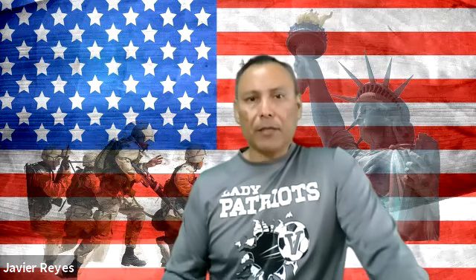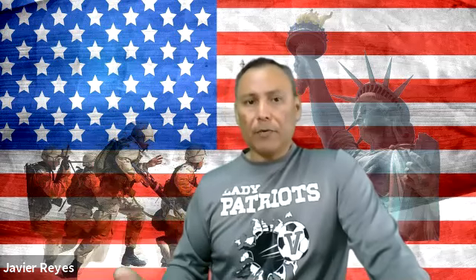Urine specimens are not tested promptly. Urine components can change. If you're going to collect a urine sample for urinalysis, okay, you cannot have it lying around the desk for too long. How long can a urine specimen be at room temperature? Up to 24 hours? No, 2 hours. 2 hours. There you go. In the refrigerator, it's 48 hours. Like I said, the lab doesn't come in to pick up specimens every hour, they come once a day. So if you collect a specimen early in the morning and they don't come until the next day, obviously it's going to have to go in the fridge.